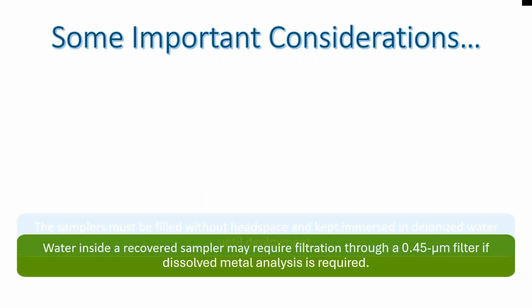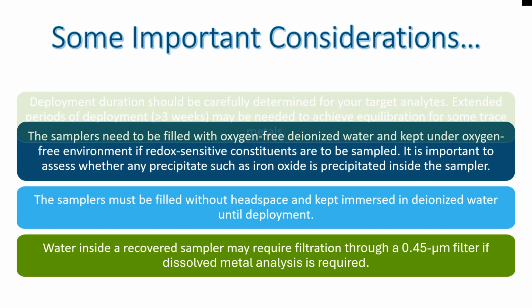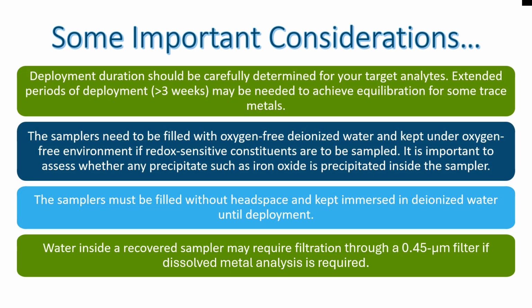Some important considerations about the NSPDS device. Deployment duration should be carefully determined for your target analytes. Extended periods of deployment may be needed to achieve equilibration for certain metals. The samplers must be filled with deoxygenated water, without headspace in the bottle, and kept from the atmosphere until deployment. The recovered sample water may require filtration through a 0.45 filter, if dissolved concentrations are desired.